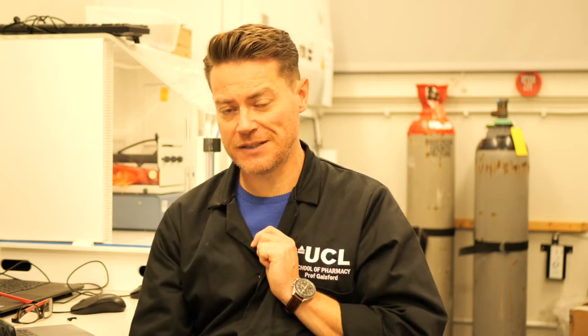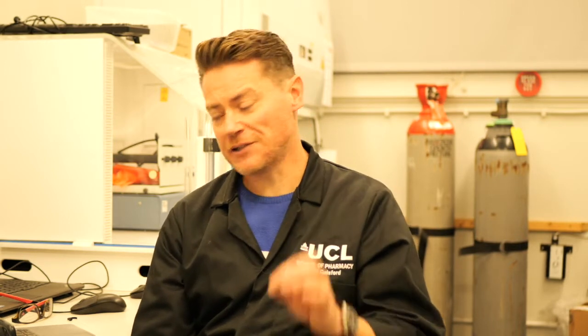You might say to me, do we sputter coat a sample for transmission electron microscopy? And the answer is no, because if we did that, the electrons won't go through it, they will actually bounce right back. So for transmission electron microscopy, we don't coat the sample. You might then say to me, isn't there a risk that we will destroy the sample with the electron beam? And the answer is absolutely. And it's very common when imaging with a TEM, you'll actually see your sample start to be eroded because it is literally being shot to pieces by the electrons. So it's one of those things where you can't really put a sample into a TEM and get it back out again. It's very damaging to the sample just making the imaging measurement in the first place.